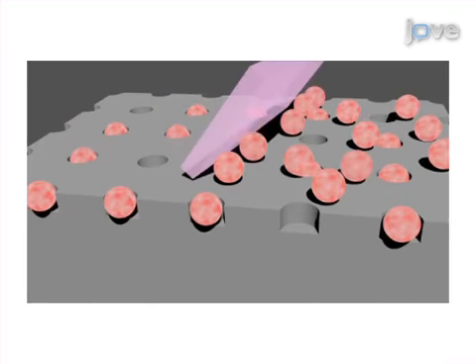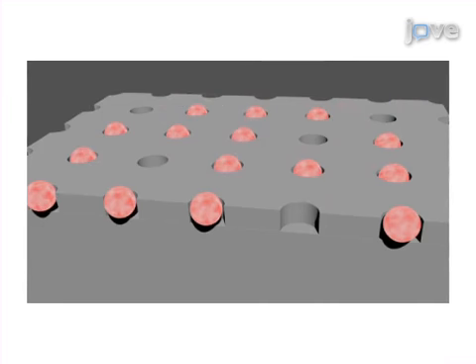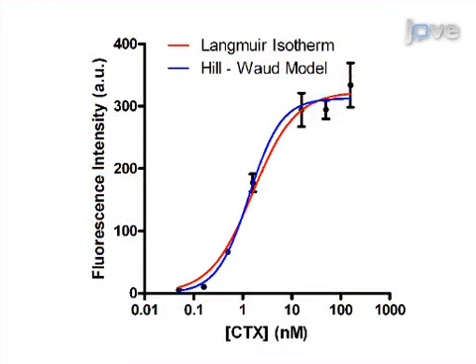The third step is to remove beads not in microwells using a polydimethylsiloxane squeegee. The final step is to image the lipid-coated bead arrays with fluorescence microscopy. Ultimately, this method can be used to determine binding constants for toxin-lipid interactions using an array imaging approach.